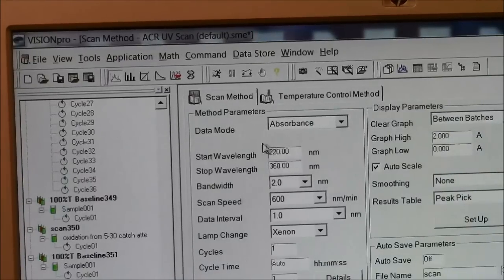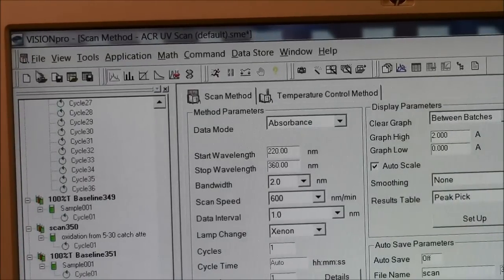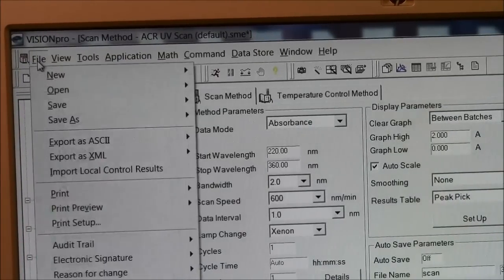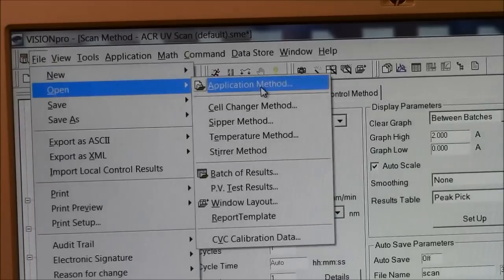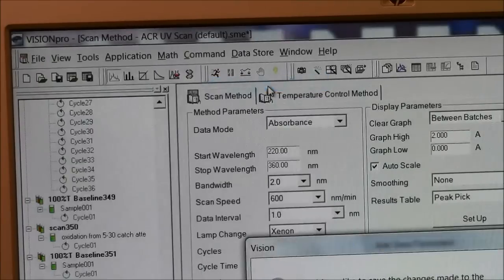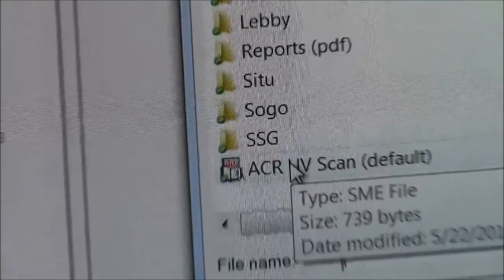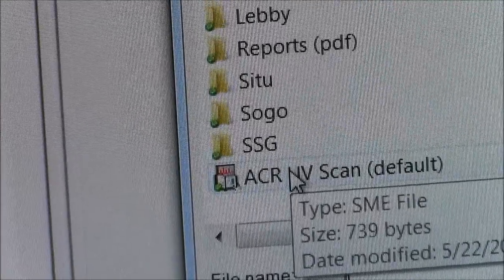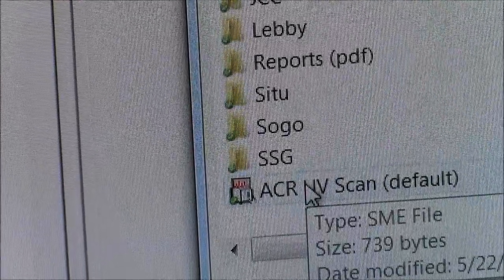Unless you know that it's been set up to your liking, you should file, open, method, application method. It should go here by default, but you want to choose ACR UV scan.